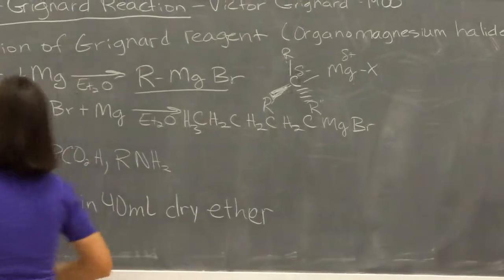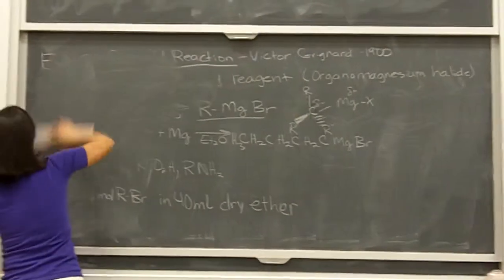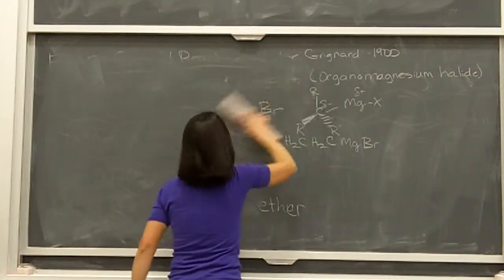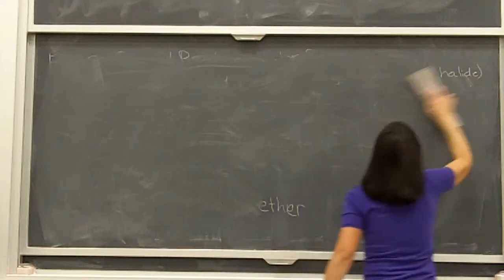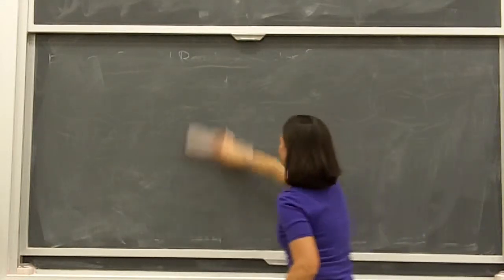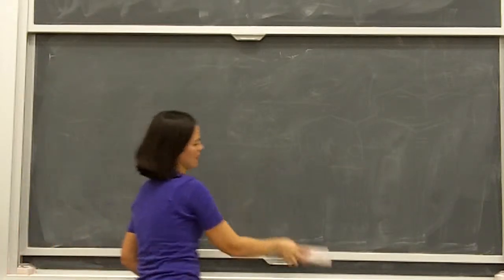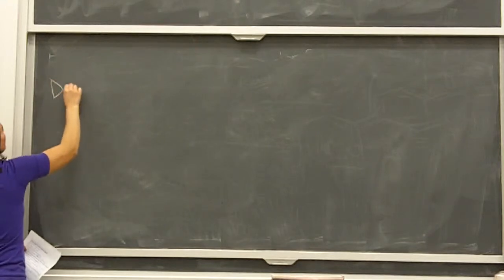Then, after this part, we are going to get to something else we haven't used before. We've got our organic layer. We're now going to dry it with magnesium sulfate, which is not the magnesium sulfate we made in our quench, but anhydrous magnesium sulfate.